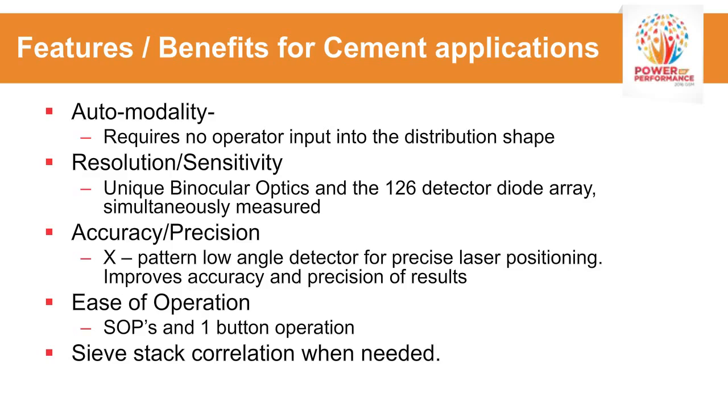And then lastly, ease of operation. Most of these systems have built-in, or you can create SOPs or standard operating procedures, and essentially allow a one-button operation for your particle size analysis. So these instruments can be used by production people.